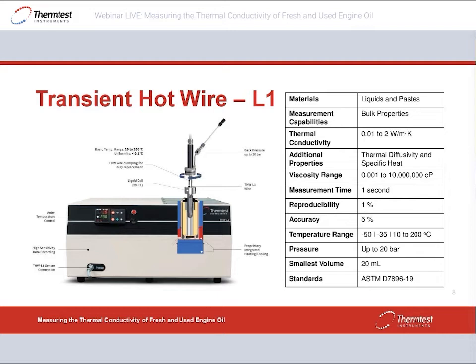There is also an option to apply pressure of 20 bar to the fluid, and the smallest volume can be around 20 milliliters. As I said before, it follows the ASTM standard D7896.